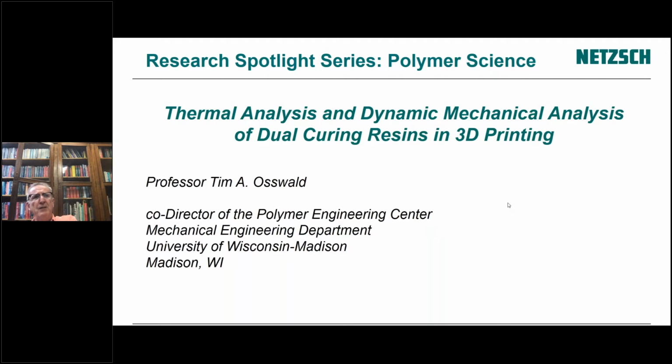That was the PhD thesis of my graduate student, John Puentes, and we've published this work together with scientists at NETZSCH. So we've tested that. The equipment and the software are perfect for that. But of course, you need the equipment, right? You need something where you can ramp it up fast enough to reach the high temperature.